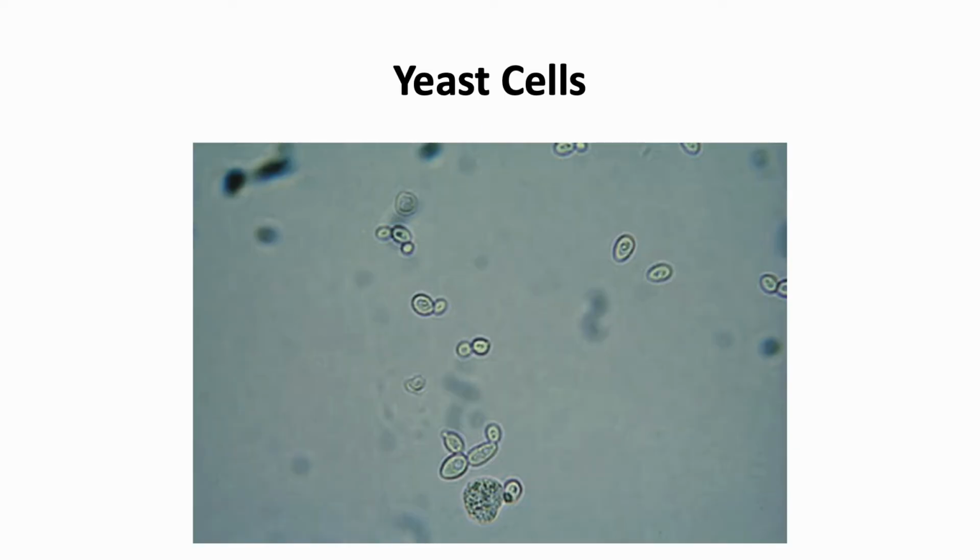The presence of yeast cells in budding forms aids in distinguishing them from the red blood cells. So they appear as small, refractile, ovoid structures that may or may not be budding. So severe infections can also show branched or mycelial forms, and presence of yeast cells is also reported semi-quantitatively, and most commonly the yeast cells present in the urine are of the Candida albicans species.